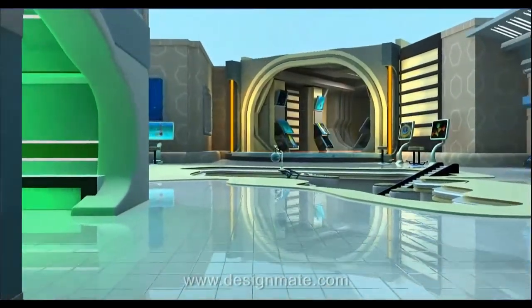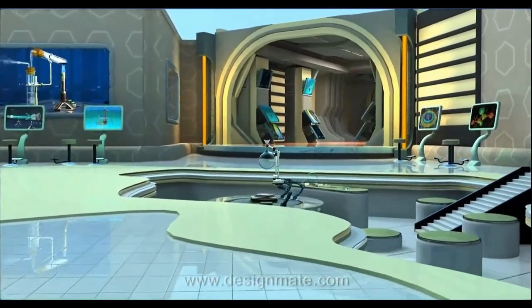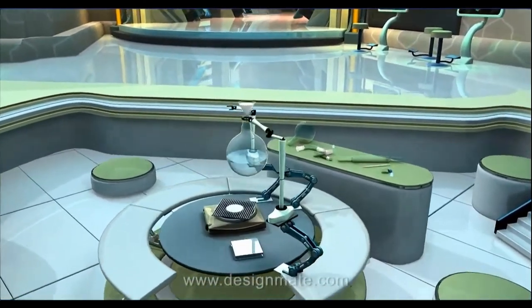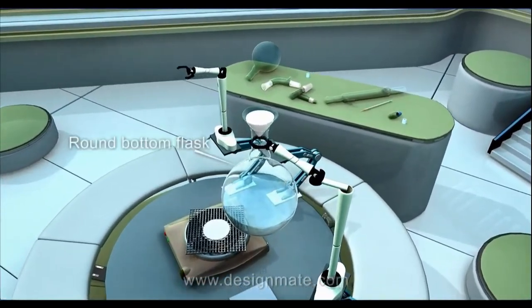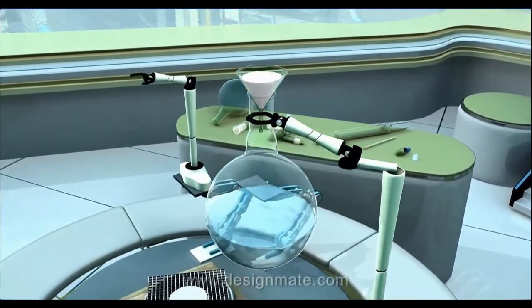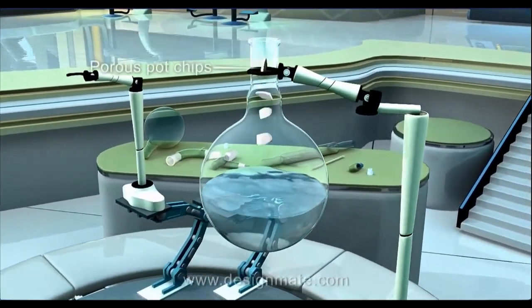Today, we shall study one of the techniques of desalination called simple distillation in our virtual laboratory. To begin, take a round bottom flask filled with seawater. This flask is known as a boiling flask. Add some porous pot chips into the flask.